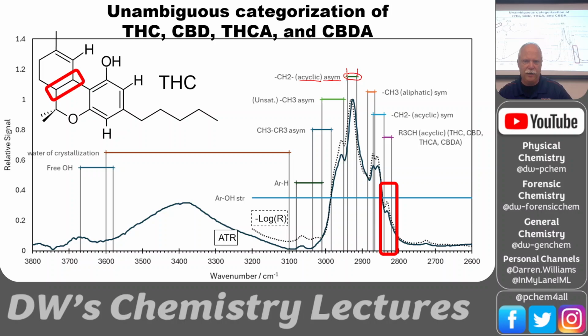I just plotted whatever the range is here and connected those two lines. And so this is a separate series. I'm just telling you how I plotted this. And then I did the negative error bars. So I said that the negative error is 100%. And so the error bar goes all the way to the baseline.